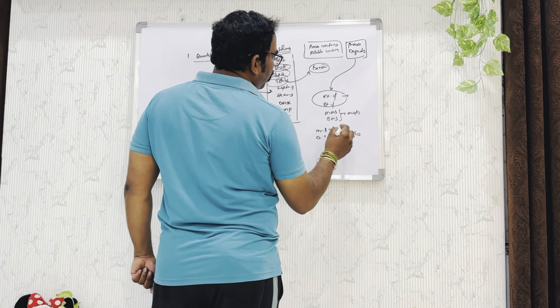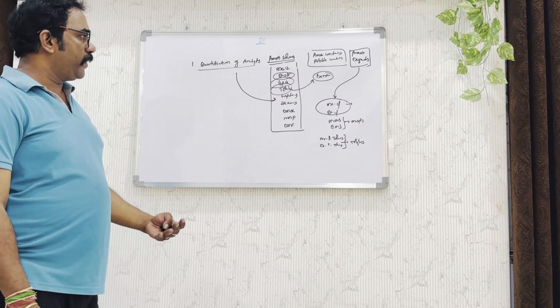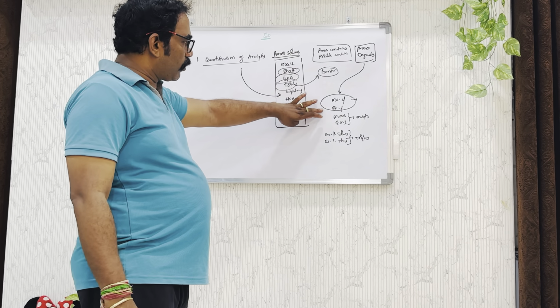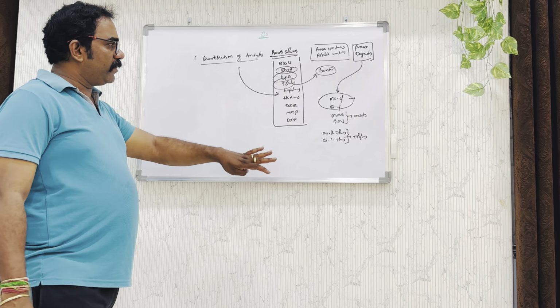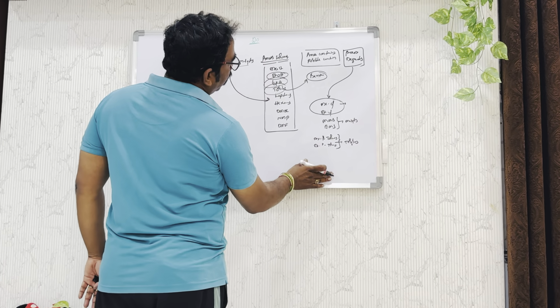How these process degradants form, I will explain in the next sessions. During the reaction, how methyl chloride, ethyl chloride, MMS, EMS come about, and what level we need to quantify as per regulatory requirement, I will discuss later. Now I am just giving information in this session.